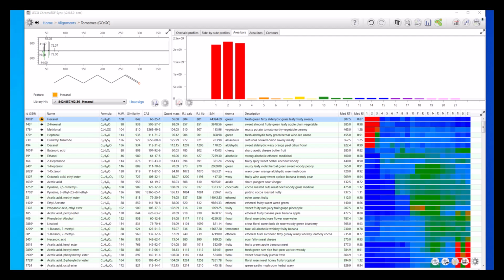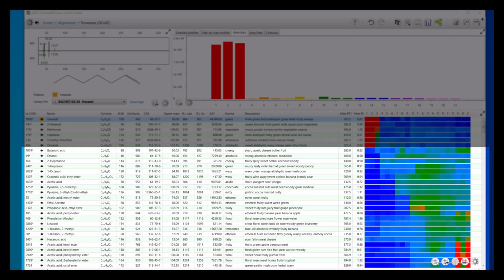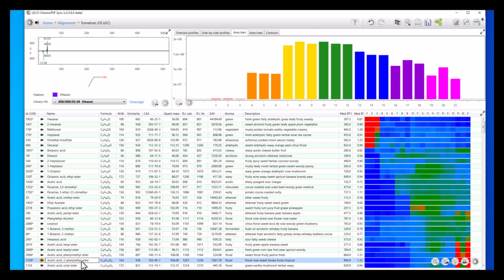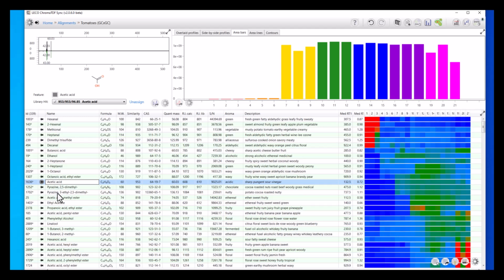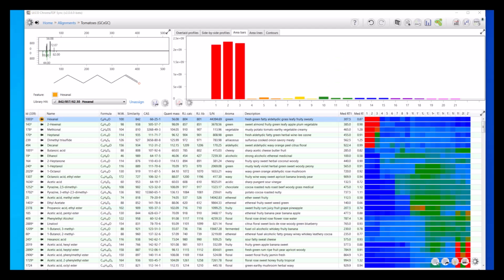There are a lot of interesting trends in this data, and we can see some representative examples here in this subset of the peak table. Some of the analytes that decreased are at the top of the table, and the bottom section shows some of the analytes that increased. There are a variety of time trends and patterns here, and we can see these in the heat map and by clicking on specific analytes in the table. Some started to increase right away, while others increased later in the process. Some increased steadily, while others were more abrupt, and some stayed at a consistent higher level, while others started to decrease. We can continue to look at individual analytes and their patterns from this table.